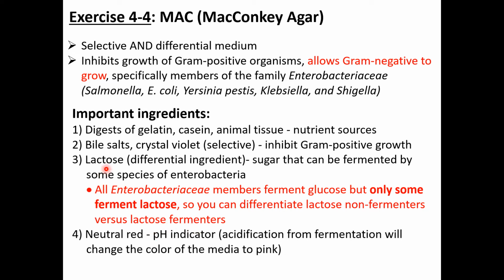Because if we had glucose, then all of them would ferment glucose. There was no way to differentiate anything. So we are trying to learn something else about the gram negatives that can grow in here.